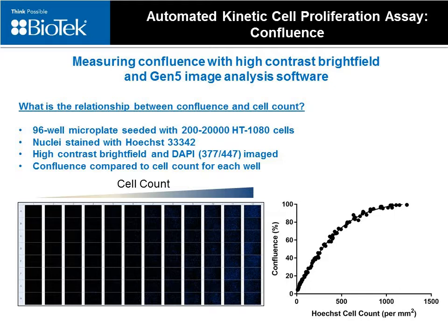So if we take the ratio of these two measurements, percent confluence versus these labeled nuclei cell counts shown in this graph, it reveals that confluence values often do not have a linear relationship with cell number. And this is especially true at higher cell densities for cell types that are not contact inhibited, like these HT1080s. Given this, for many applications, direct cell counts clearly would be the preferred method for determining the size of a cell population and for measuring changes in the population size over time.